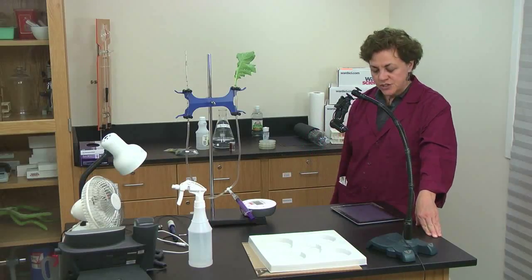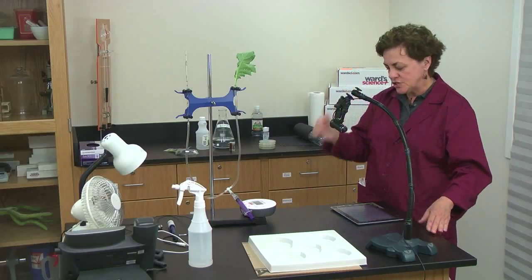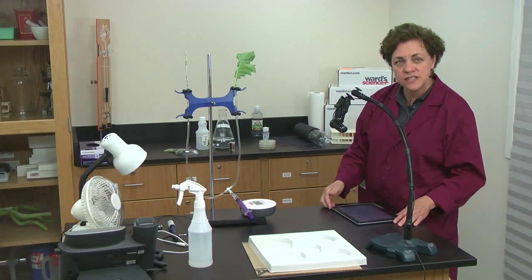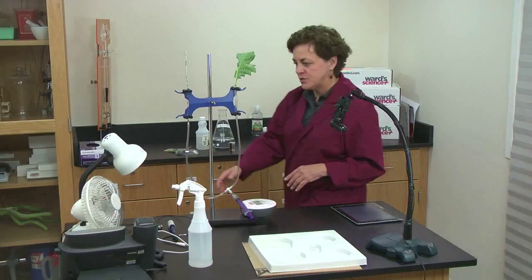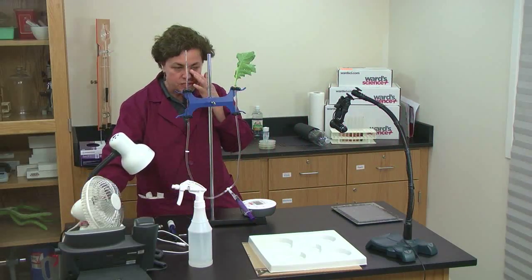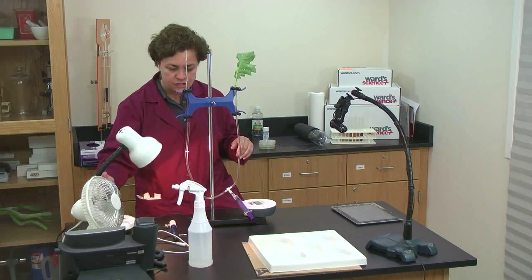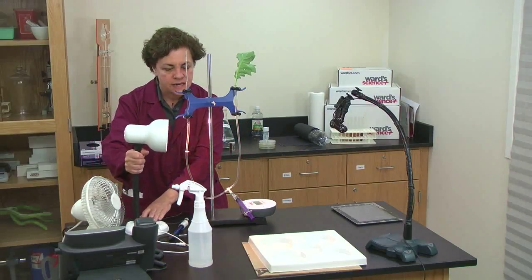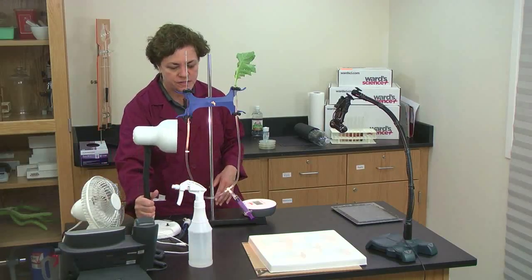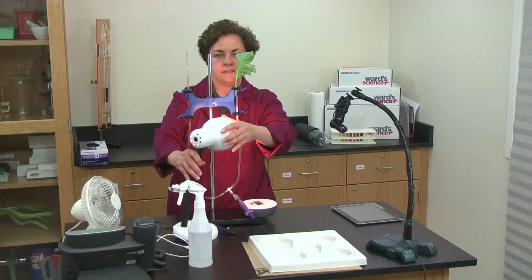Some of the ways that are suggested to change things for inquiry are to add light or add a fan. And what you can do is have different groups do different things. You can put a light on your plant.